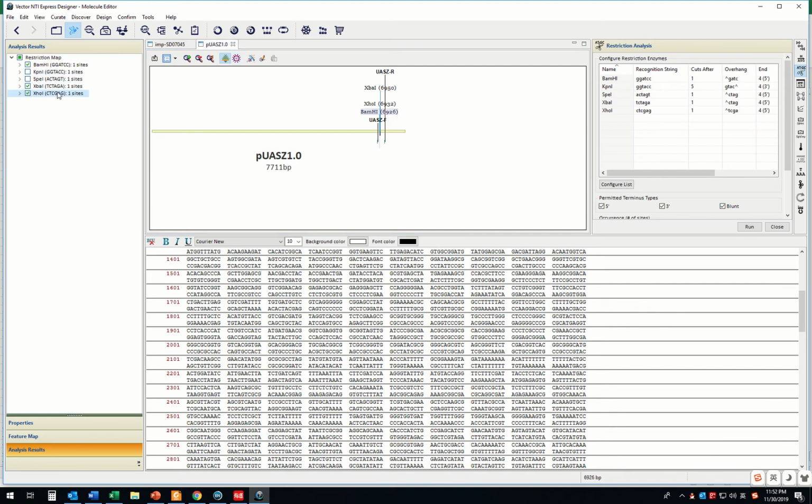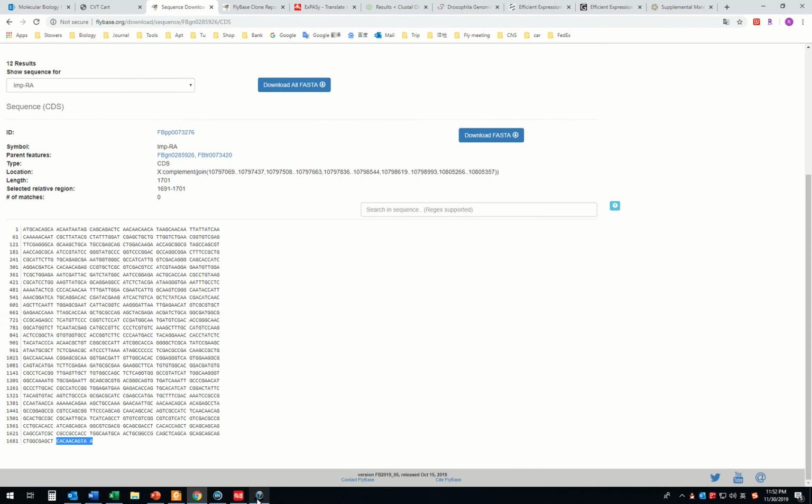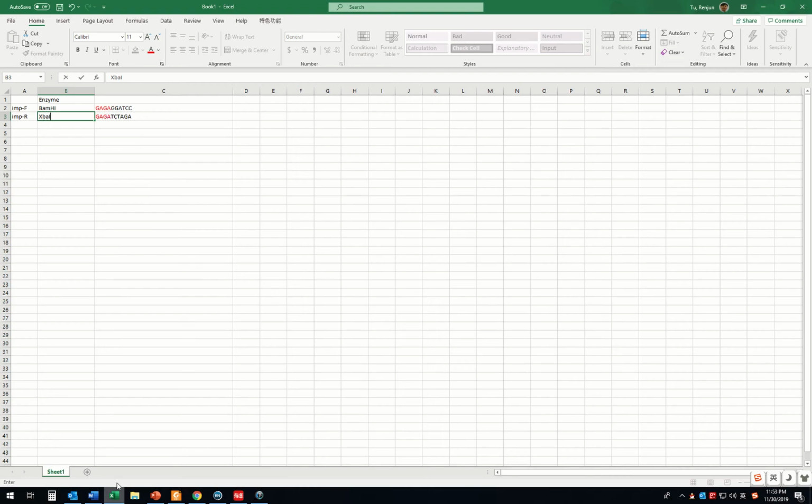Where is XhoI? No, not good. Yeah, XbaI. BamHI, XbaI.